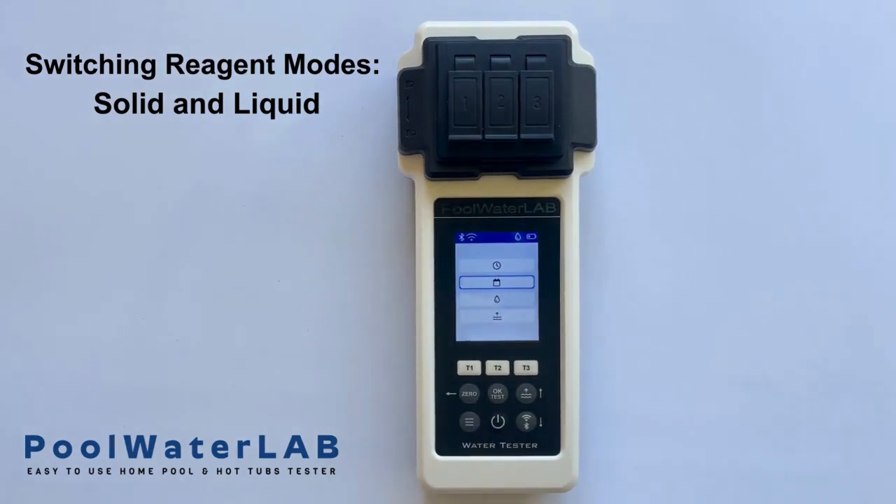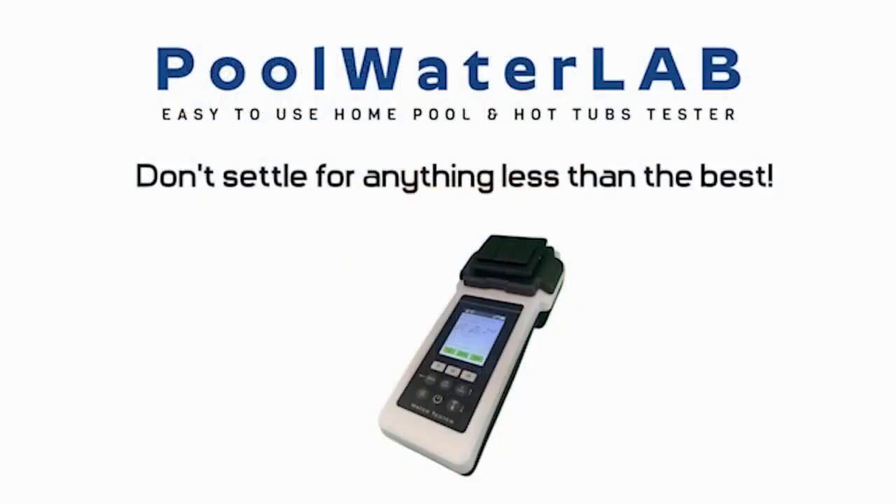After correctly selecting the mode, press the zero button to proceed to the testing phase.